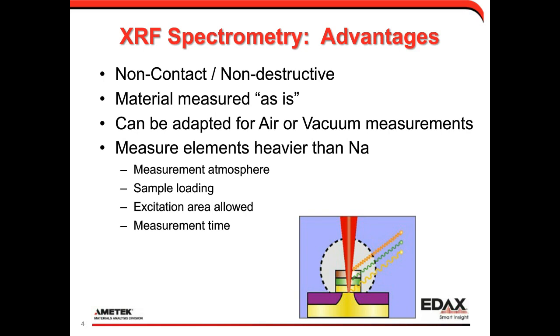If we're allowed to measure over a larger area, let's say for blanket coatings, it's possible to get more sensitivity to a wider range of elements. And of course, measurement time. The longer we measure for, the more sensitive we are.